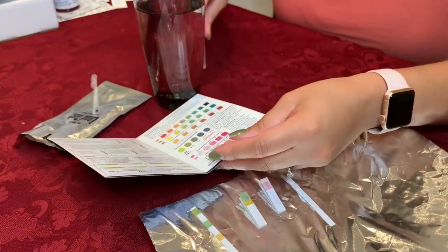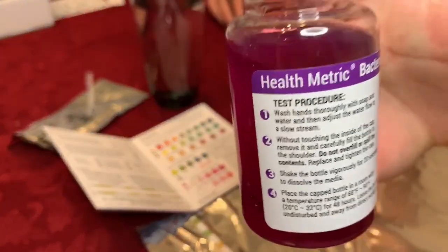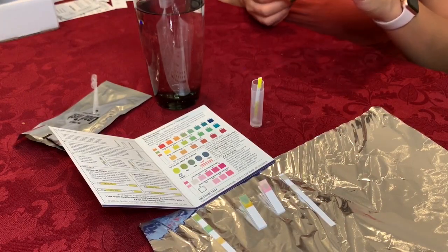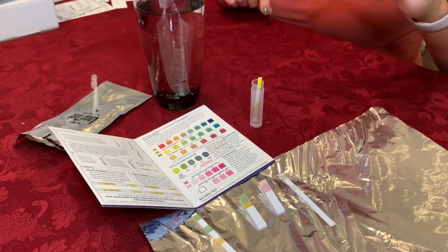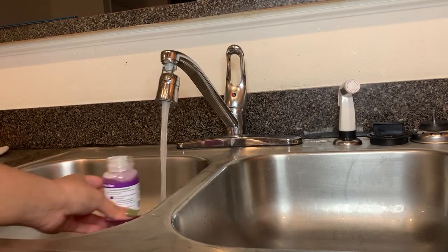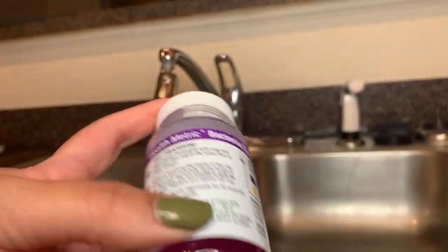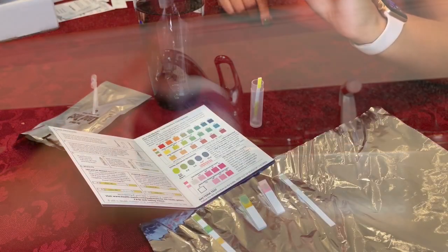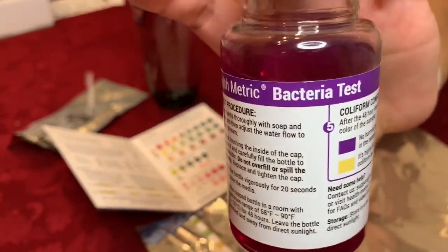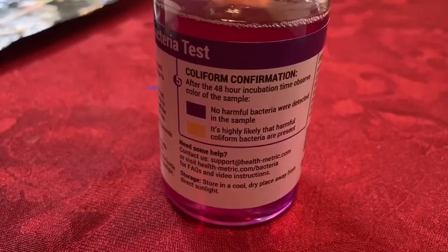Pretty satisfied with all the results so far. The final one was bacteria. I already did this ahead of time because this takes two days to test. All you have to do is wash your hands first, and then don't touch the inside of the bottle, but fill up your water to the top of the bottle, shake it up, and then just wait. Keep it out of direct sunlight and wait two days before you look. You can tell right now that the color of the water is purple, and that indicates that the water is safe — there is no dangerous bacteria present in this water.